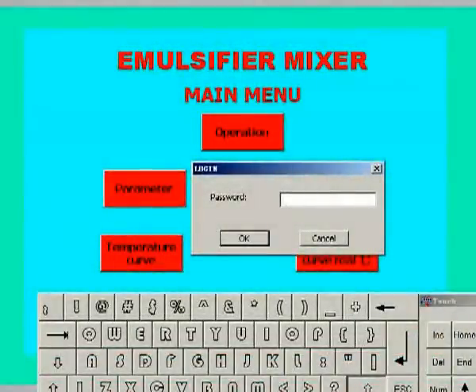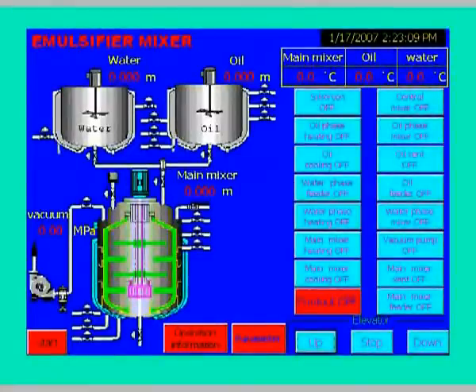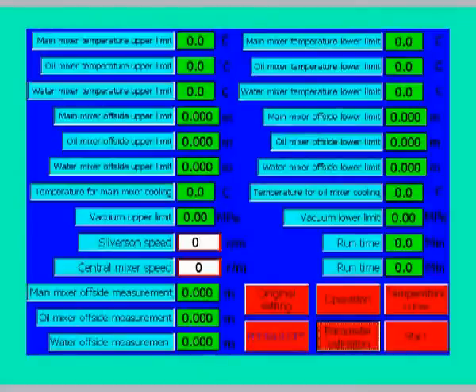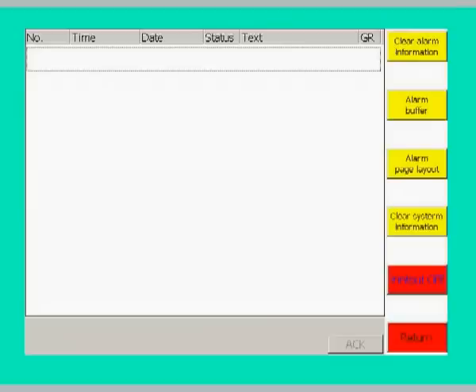On the function screen, we can enter into any screen and make any function control. Parameters can be easily changed from the parameter setting screen. Other parameters and functions are also displayed in the HMI, for example: review of current parameters, temperature of the tank, alarm record, and plotting of time-temperature curves.